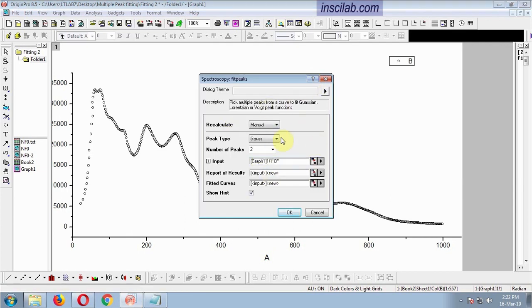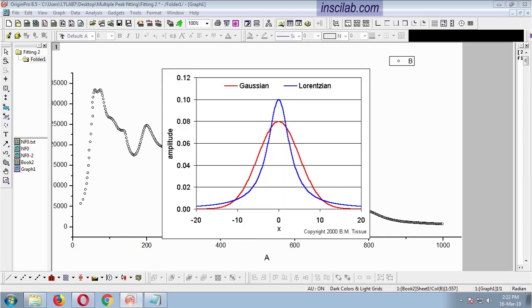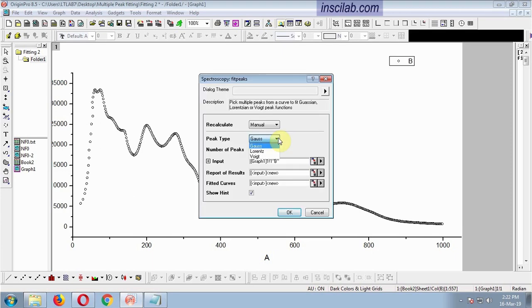There are 3 peak types available here: Gaussian, Lorentzian, and Voigt. Which one should you use? Let's have some basic knowledge about these peak types. This is how the Gaussian and Lorentzian peaks differ from each other. In a very non-specialist language, if in the spectrum the number of peaks are spread more near the baseline and overlapping each other, then you can go for Lorentzian. If the peaks are very sharp, then go for Gaussian.